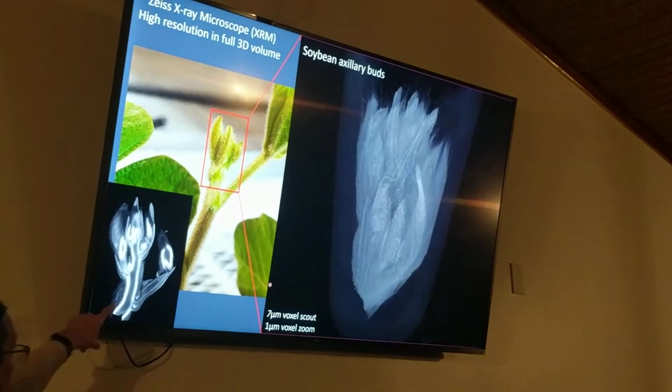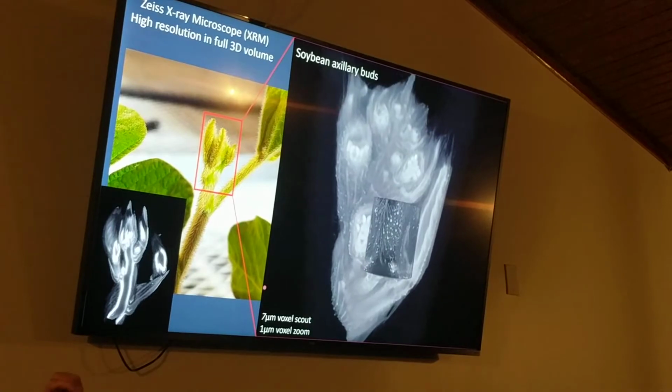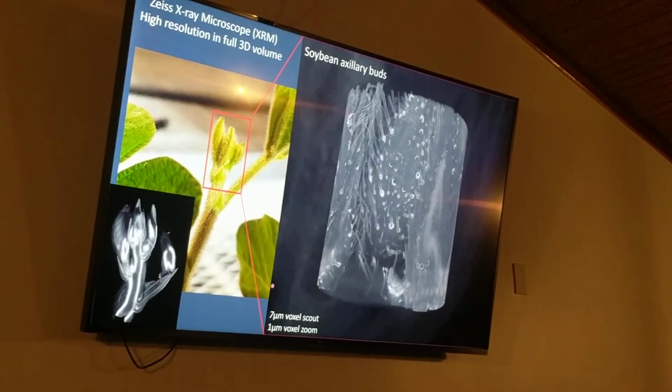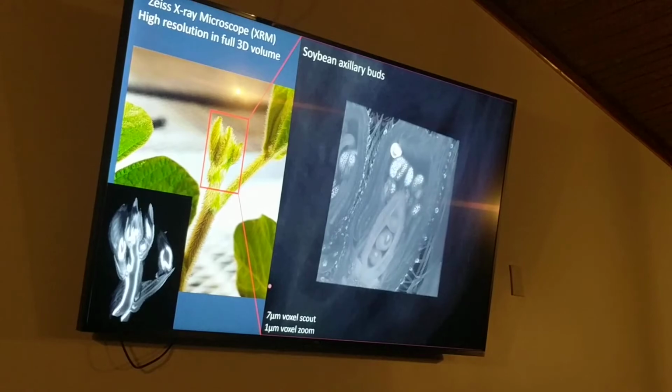This is the other image, from the other microscope. If we look at the exact same tissue, we can look at the whole thing at one resolution and then focus in on one region of interest, all just by controlling the microscope with a keyboard and a mouse. And I can even do it remotely from home. TeamViewer is wonderful.